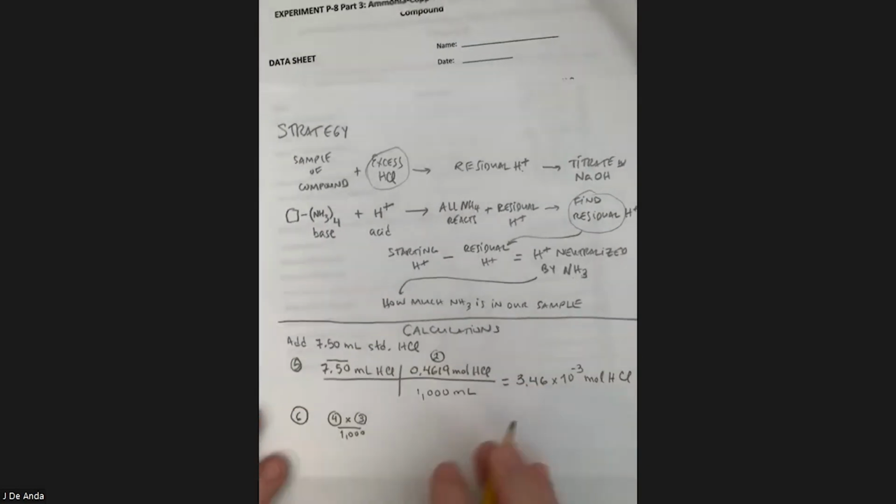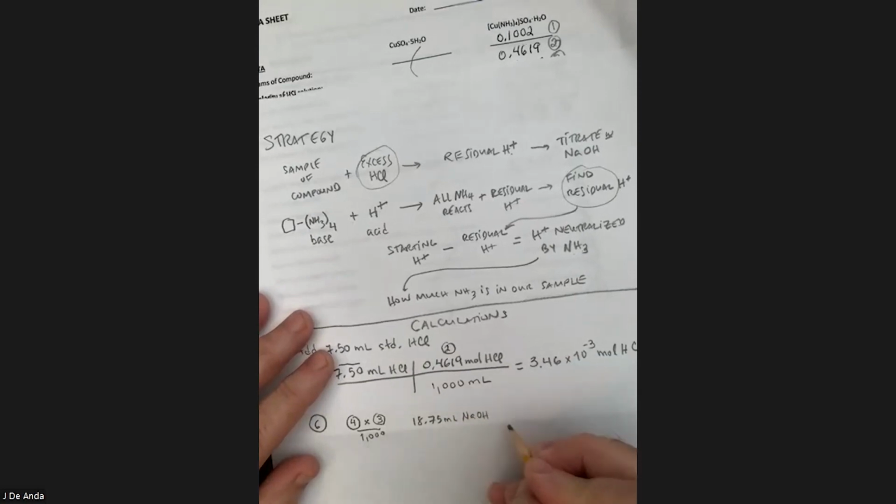So this is the number of moles of NaOH used. So this is number 6. Again, we used item number 4 times the molarity of the NaOH, which is item number 3, divided by 1,000. In other words, we used, according to our chart, 18.75 milliliters of NaOH.